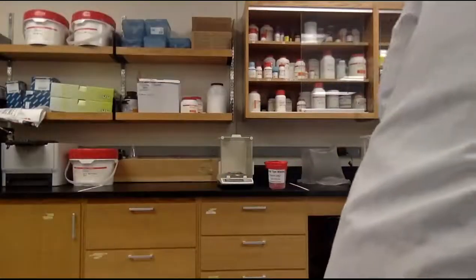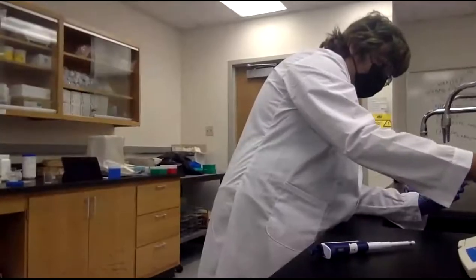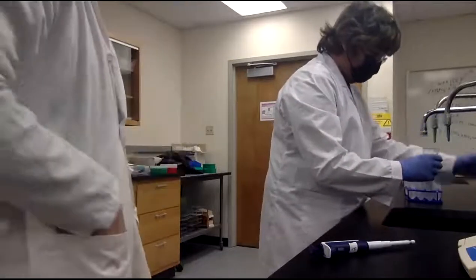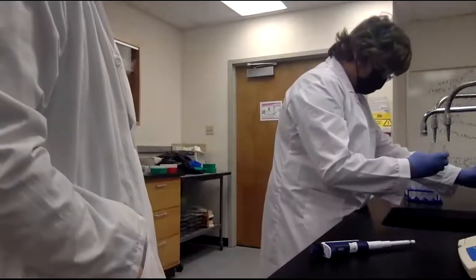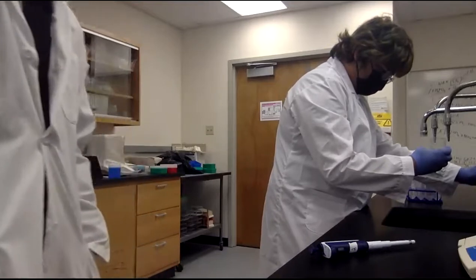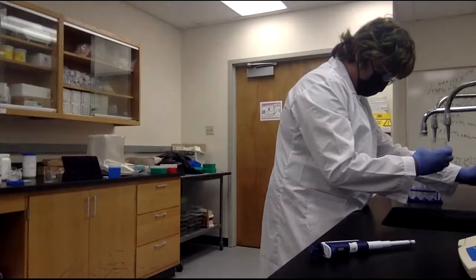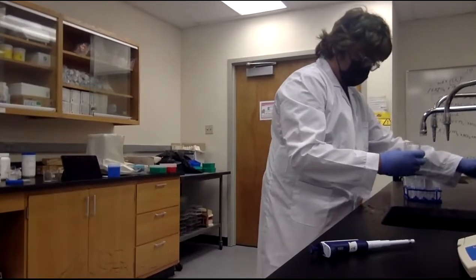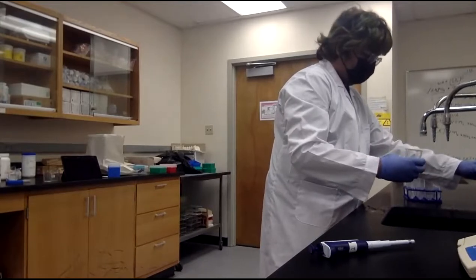You can just use the water from here, but make sure the pressure is pretty high. So use the red one, left one. Like I said, the pressure is pretty high, so make sure you hold it tight. I guess you have to remake it. That is high pressure.